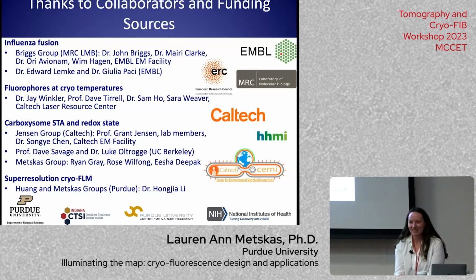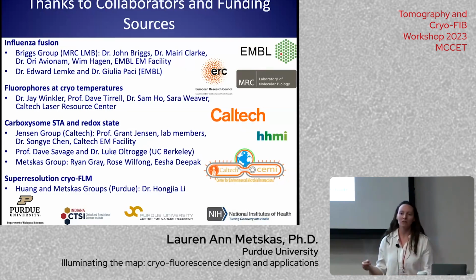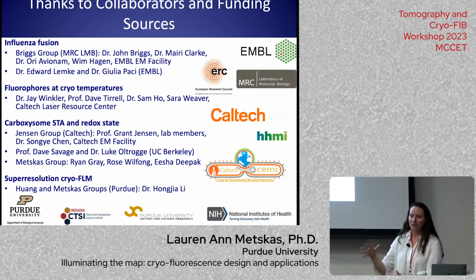So my question is, you're talking about how important it is to select bright fluorophores if possible. Is photostability also something to consider or not as much? That is a great question. So yes and no. If you have a fluorophore that would photobleach right away, that's not going to be a problem in cryo at all, because photobleaching comes when molecular oxygen collides with the excited state. We don't have collisions, so we don't really get that.